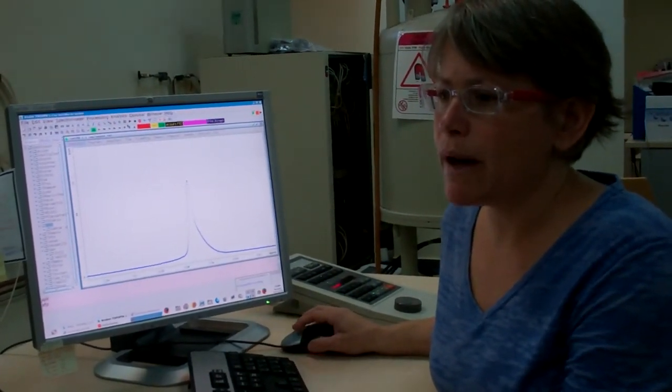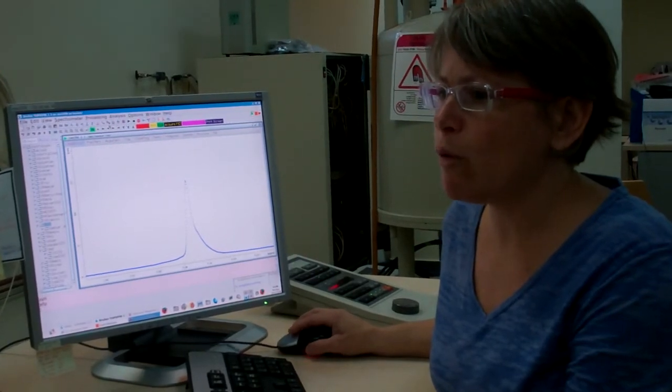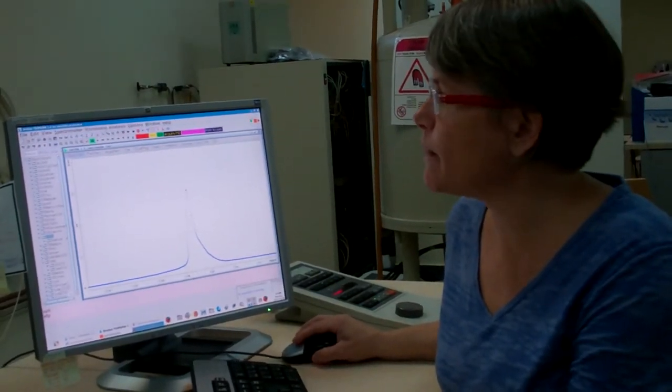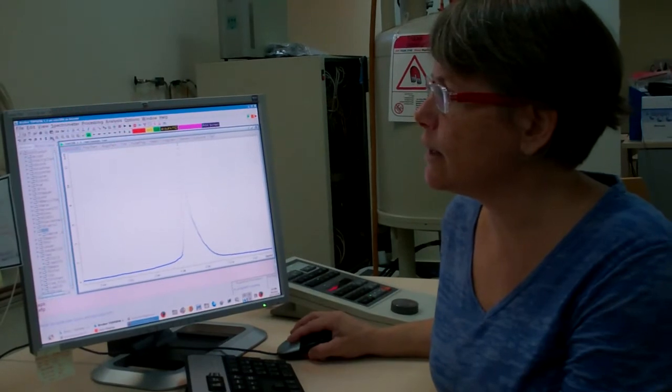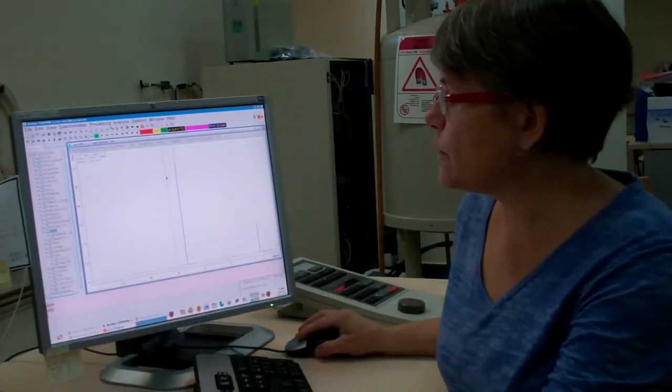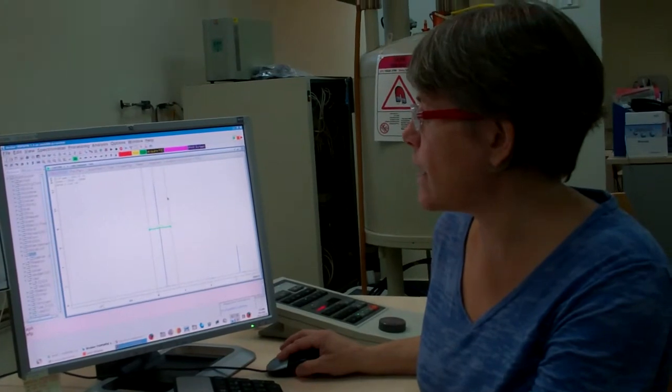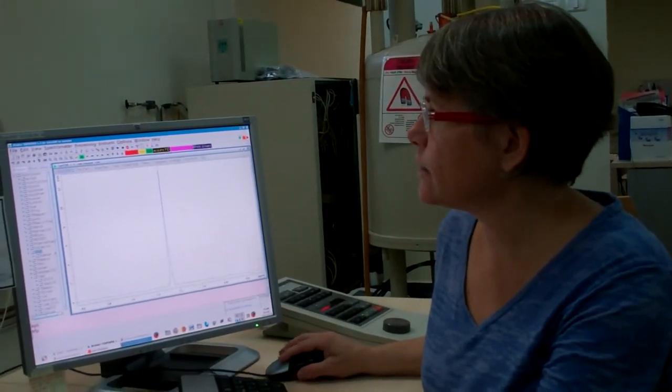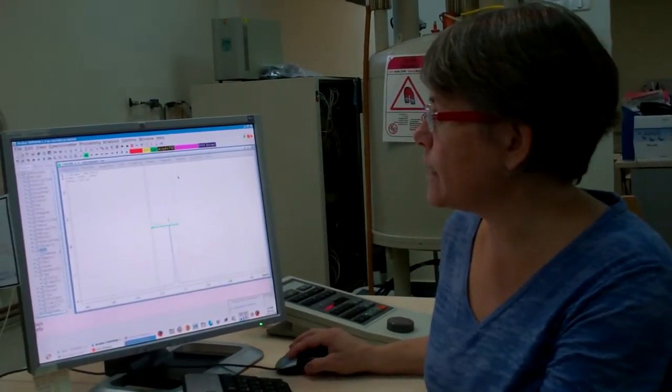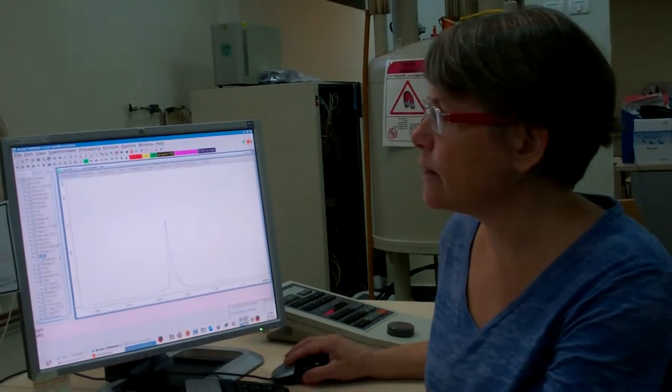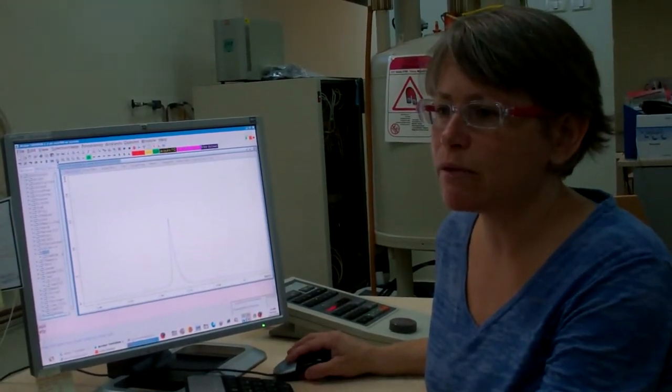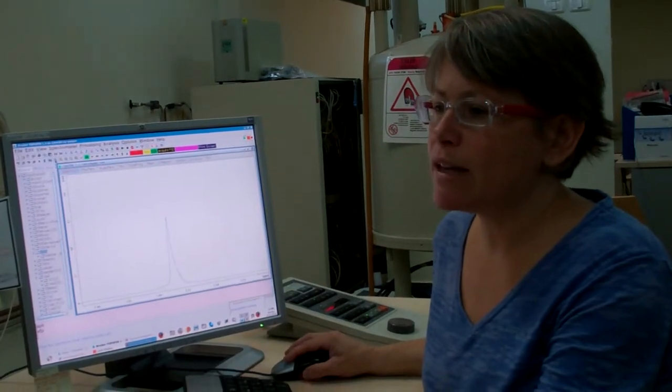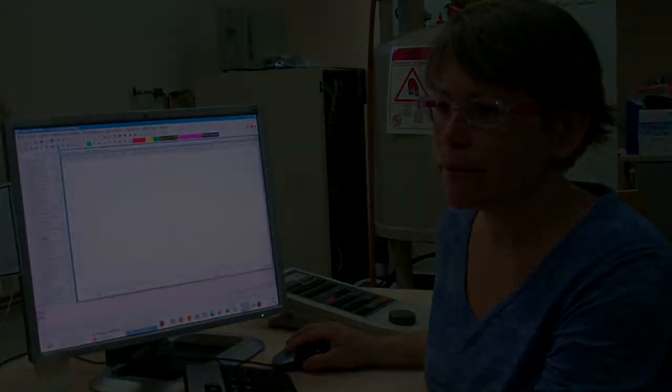These two buttons automatically give a full Y and full X display respectively. This one, and this one. Let's zoom in again. Left click, drag to the other side, and release. We can zoom in so that we can see the peak very clearly. And this one button, with the magnifying glass with an A, does the same as those two last clicks together.